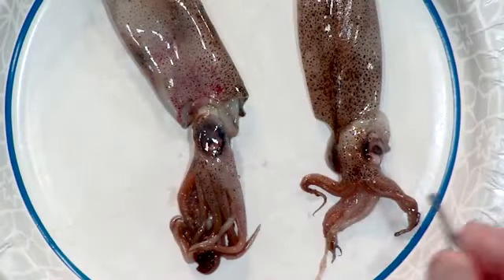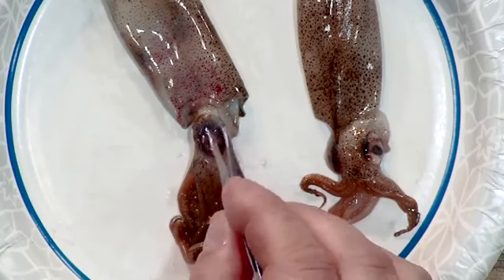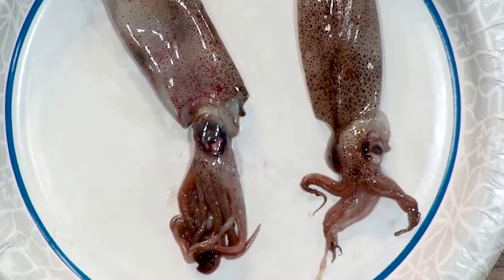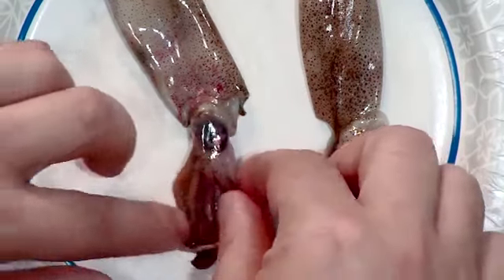So if you investigate this eye, it's a little cloudy here in the middle because there's fluid there, but behind that, it's got an iridescent shine to it, a very reflective looking eye. And I'm going to spread out the tentacles here.